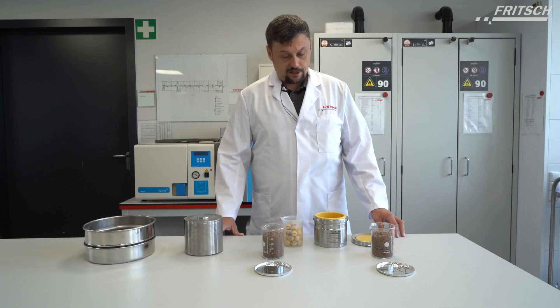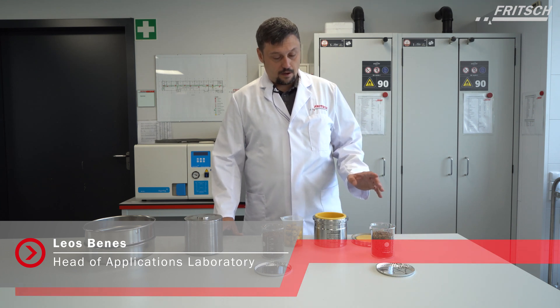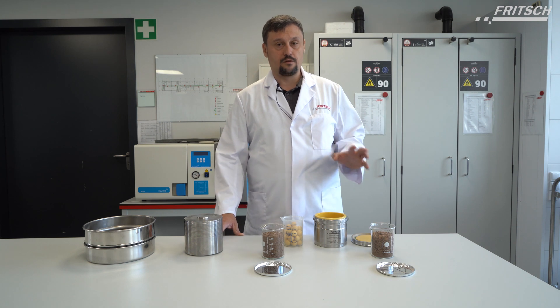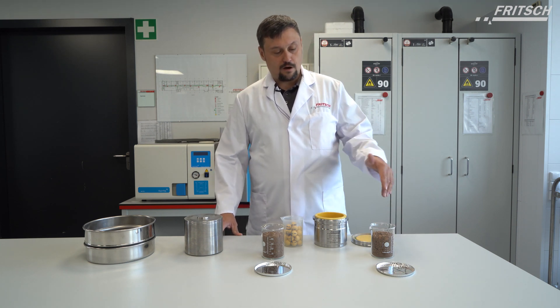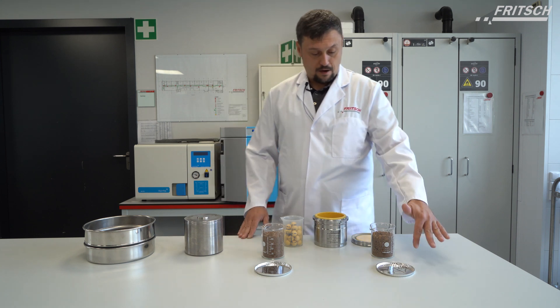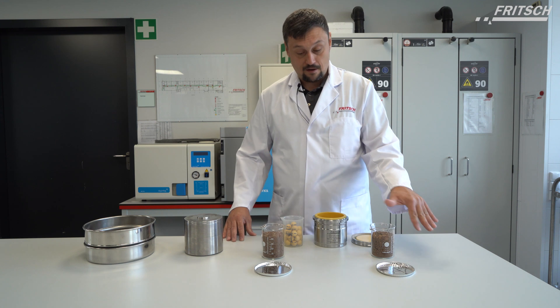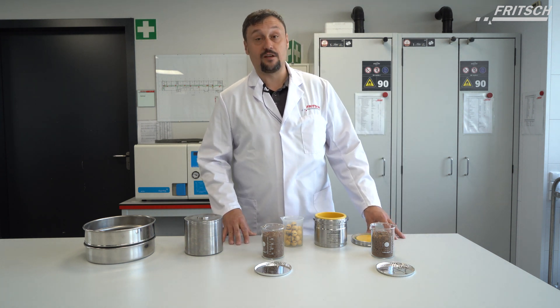Welcome to this application video about soil grinding. We have the request to do different tests with different types of soil samples. We took two typical soil samples from the backyard, let them dry overnight, and we have a rest moisture of 1.4% in sample A and 1.26% in sample B.